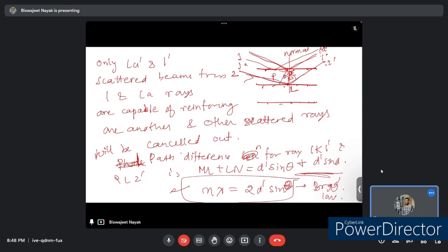In different directions, the scattered beams are out of phase and cancel out each other, which we normally call destructive interference. The rays scattered by all the atoms in the planes are completely in phase, and they do constructive interference, forming a diffracted beam in the given direction.